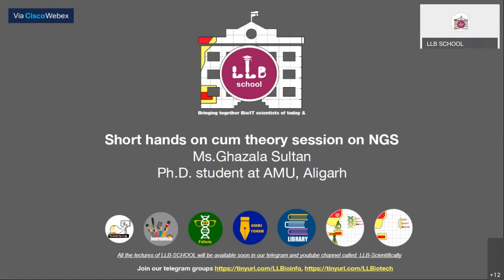Today she is going to handle an introduction session on next generation sequencing, and this will be a short hands-on cum theory session.